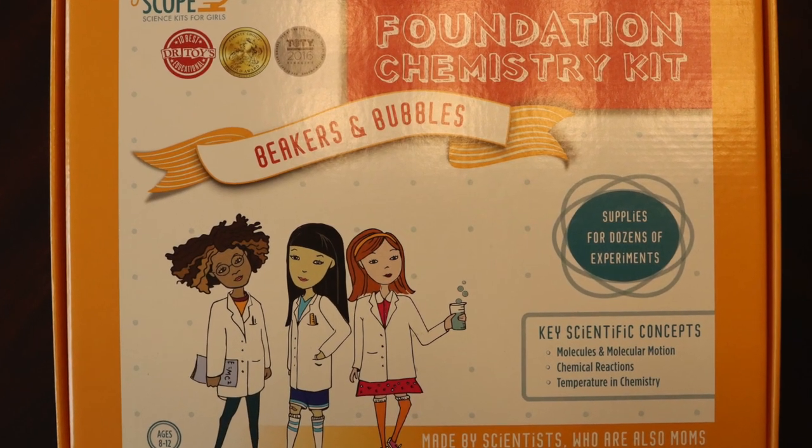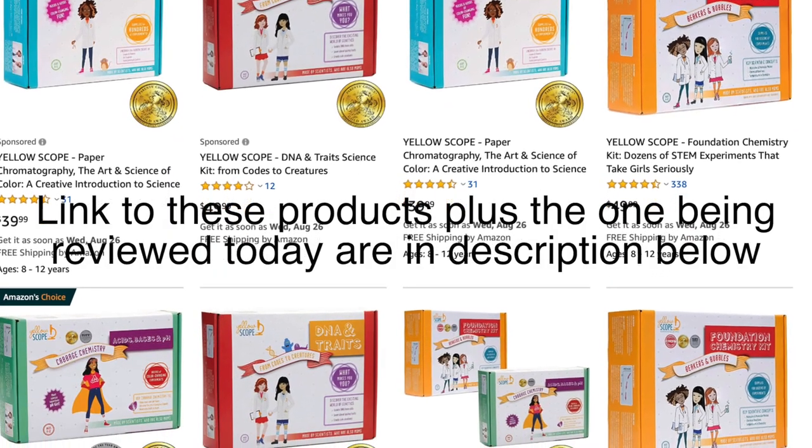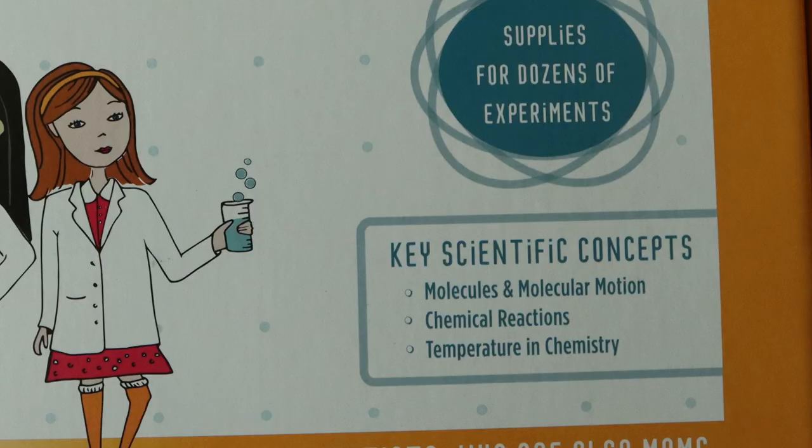Today we're reviewing the Yellow Scope Beakers and Bubbles Foundation Chemistry Kit. If you're not familiar with Yellow Scope, they are a company that develops science kits focused on building scientific interest in young girls. The chemistry set covers three main chemistry topics: molecular motion, chemical reactions, and temperature in chemistry.